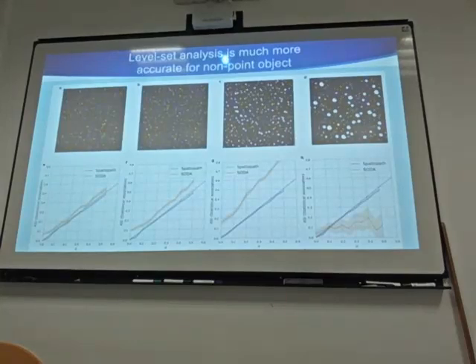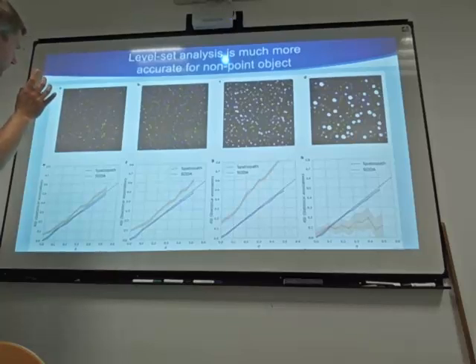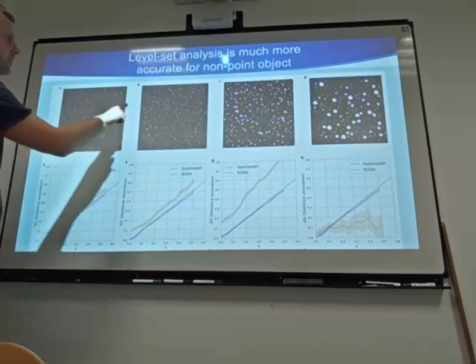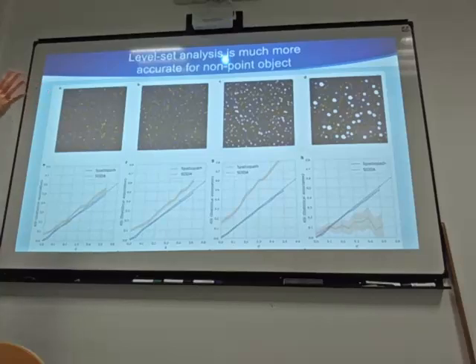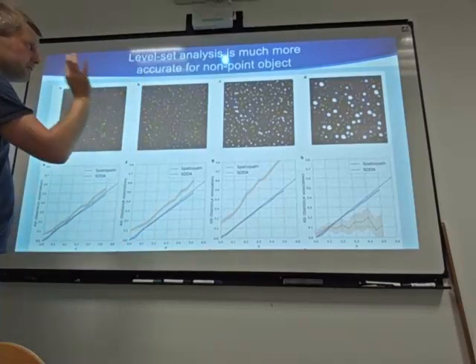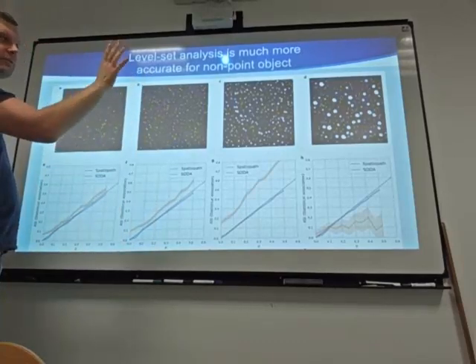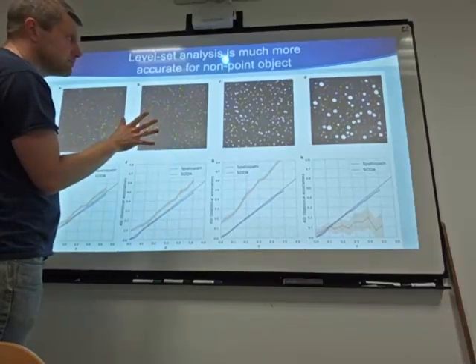And it is important, this is just a simulation that we did, where, let me just remember, so we have red, and I'm colorblind, so it's very difficult for me. So here, I think we have red points, red objects. And around these red objects, we have blue points that are associated to the red objects at some distance, and green ones that are randomly distributed.